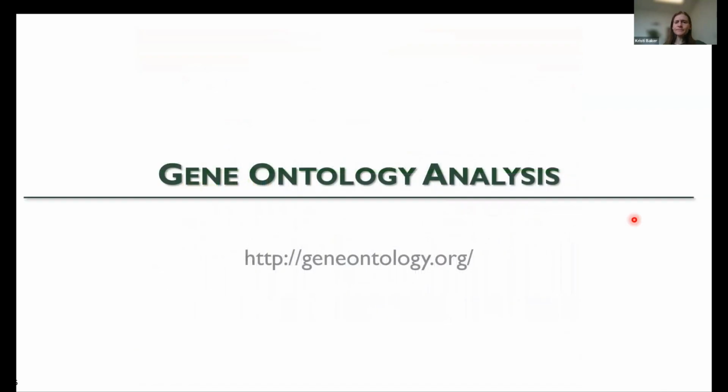All right. So gene ontology is the next thing we're going to look at. And this is something that a lot of people do. So let's say you do sequencing. The gene ontology is going to give you a way of looking at, let's say you have a huge list of genes and you want to know, are these genes associated with specific functions or signaling pathways? It's the gene ontology analysis that you're going to want to be able to do.